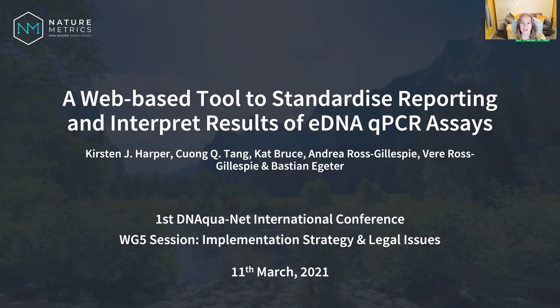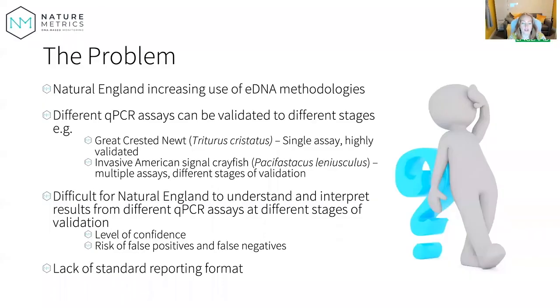As quick as a flash, today I'm going to be giving you a brief overview of a web-based tool developed by Nature Metrics and funded by Natural England. Different qPCR assays can be validated to different stages, which can make it difficult to understand and interpret results.